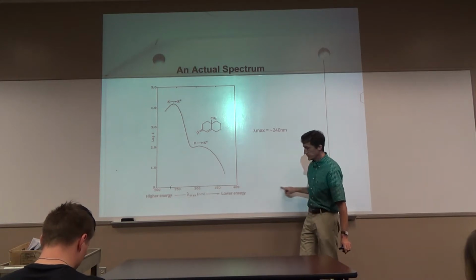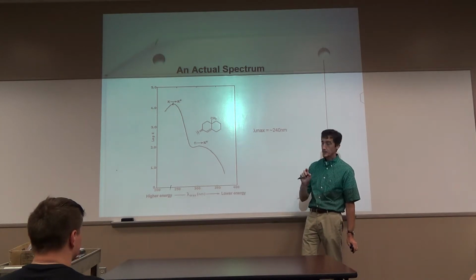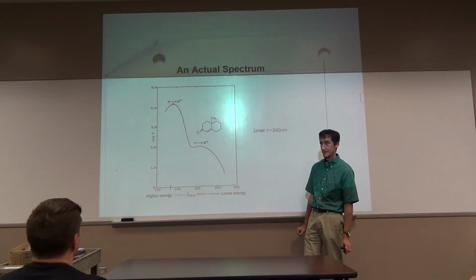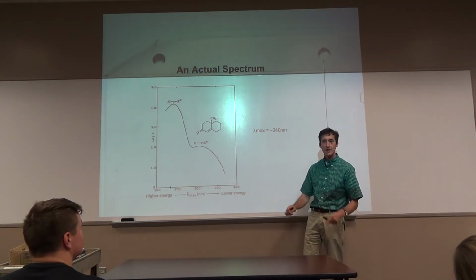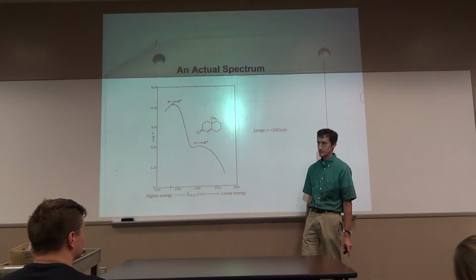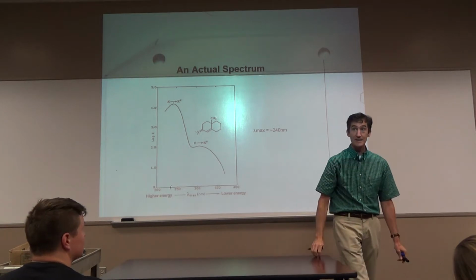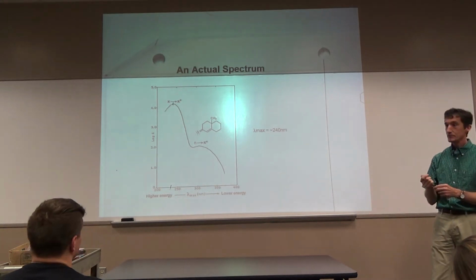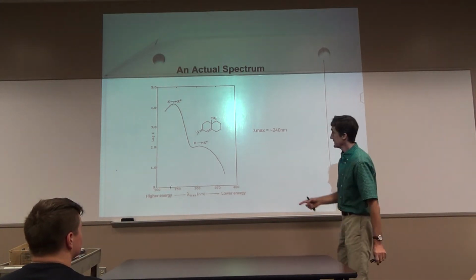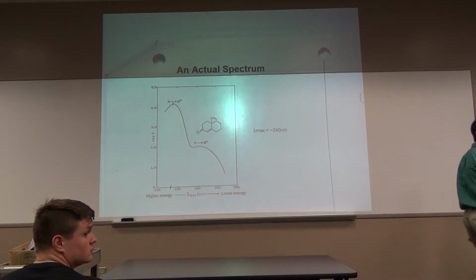Do we have any absorbance in the visible? No. Apparently not. I'll go ahead and give you the answer. What color does this compound look like? Colorless. Like water or ethanol. Why? To be colored, you have to absorb in the visible. Why is that wall blue? There's some pigment in the paint that is absorbing visible light. If you don't absorb visible light, you will be colorless. This compound is not absorbing visible light. Colorless. Make sense?